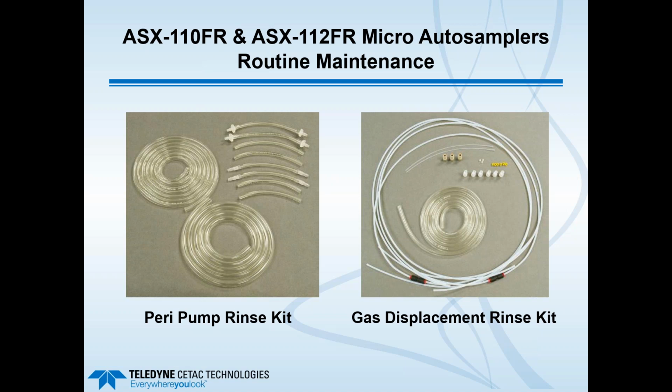Again, the PVC tubing in the middle there would not carry any of your rinse solutions to the rinse station. That would be for the gravity drain from the rinse station down to the waste. The supply of liquid to the rinse station would be through the fluoropolymer tubing and would not touch peristaltic pump tubing.